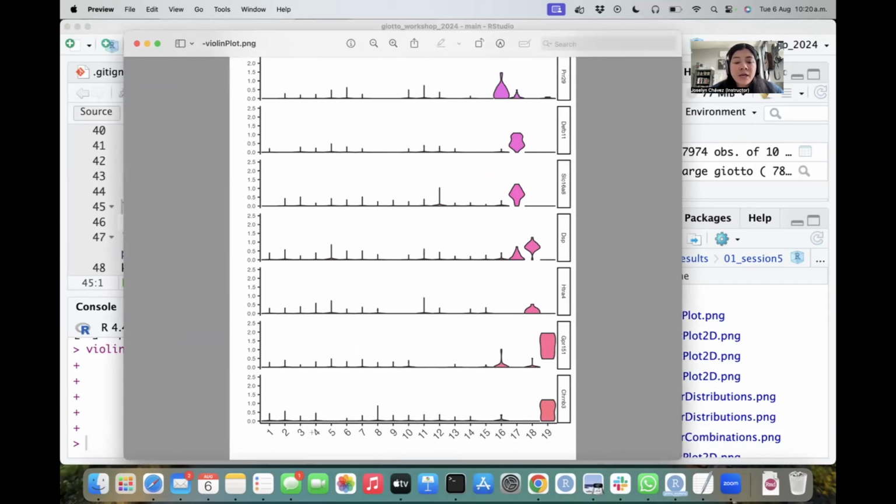And then it's showing each of the top N genes. Here we have on the right the gene IDs, and basically the distribution of the normalized expression for each of these genes. So from here we can start seeing some genes corresponding to particular clusters.